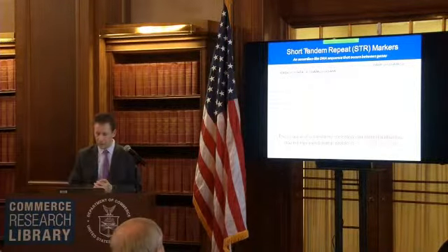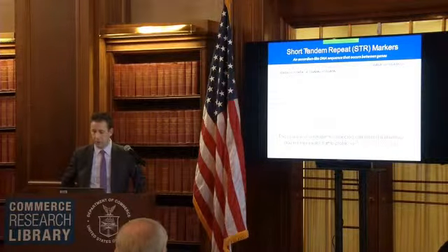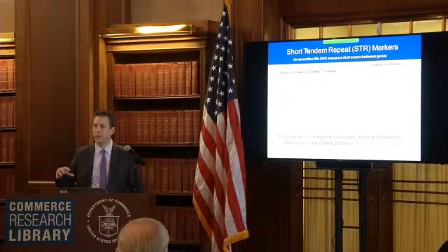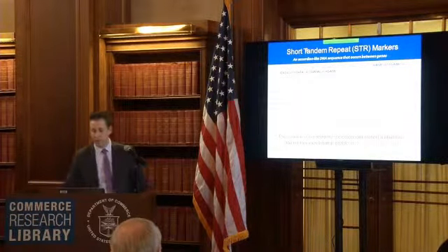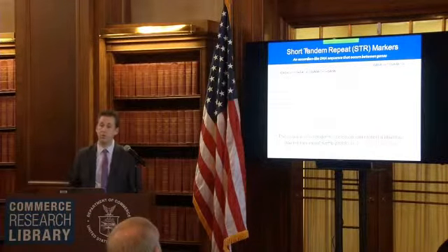This is an example, and a statement that would be used in court is the chance of randomly selecting an unrelated individual having this exact same profile is 1 in 6.7 billion. So that's where these numbers come from, these really huge numbers that you hear about. It's really from taking these frequencies, multiplying them together, getting a frequency of that profile, and taking 1 over it.